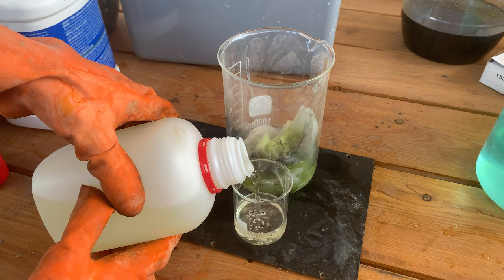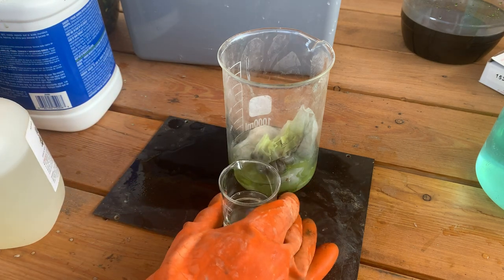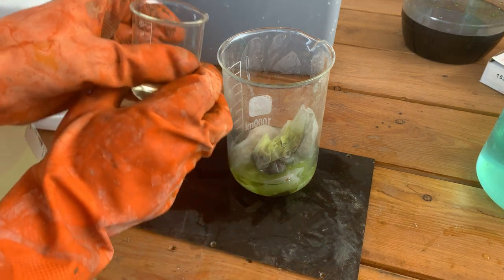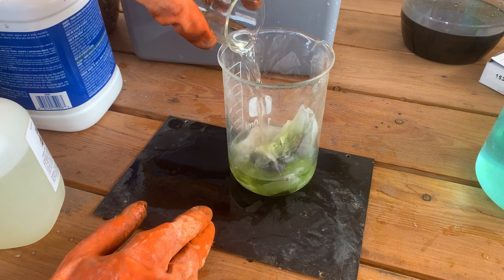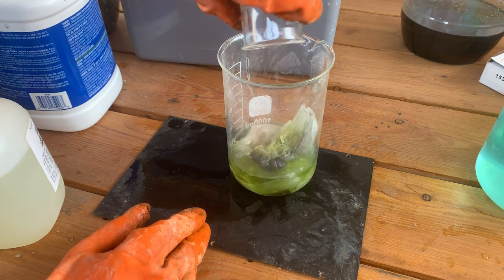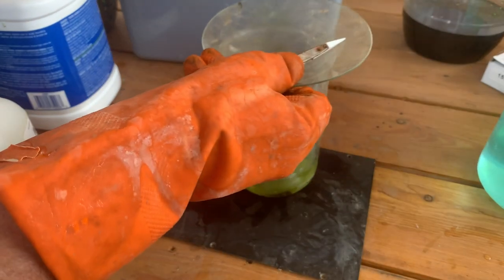We have a small beaker here and we're going to add in about 50 milliliters of nitric acid. There's some cotton seed that got in there — it's going to go in the mix, I guess. We'll cover that and let it go for a little while until it all dissolves down.